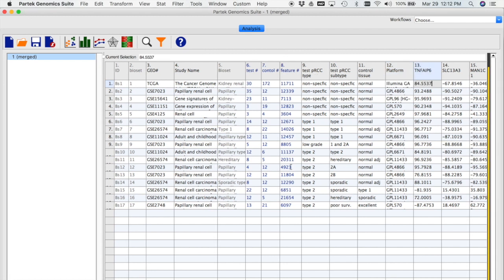In our previous series of videos, we had collected all the Illumina normalized scores for the top 5,000 genes differentially expressed in our meta-analysis. Again, these top 5,000 genes are based on the sum of the absolute value of these gene scores. We also formatted the data to reflect the type of change that occurs in that particular comparison. So in this case, this gene went up since it has a positive value in this comparison, while this particular gene went down. Again, the scale based on our formatting is from negative 100 to a positive 100.